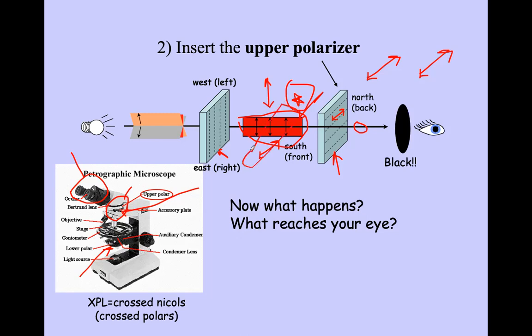Okay, so then what happens if you put a sample? This incoming light will be going through the sample and then enter the second polarizer, right? So if the minerals can change the vibration direction somehow, and if they can produce any light ray which can be vibrating along this direction, then what will happen? You will have some light here, right?